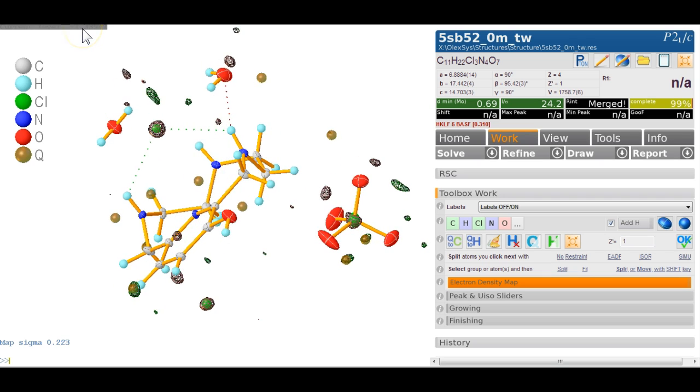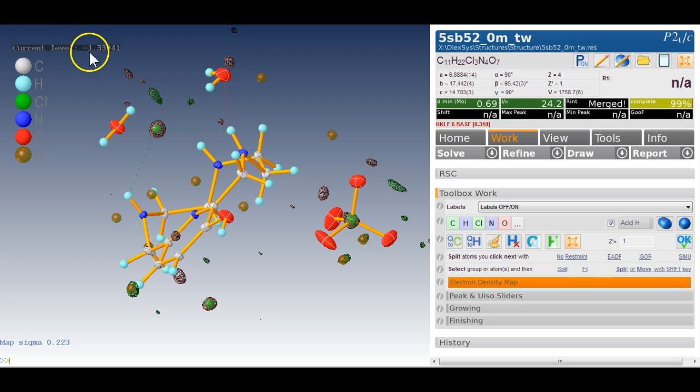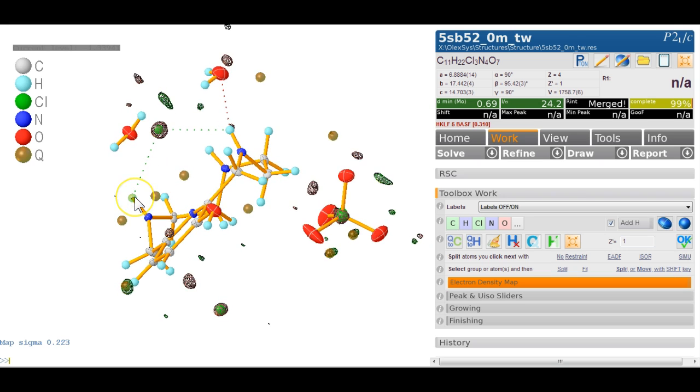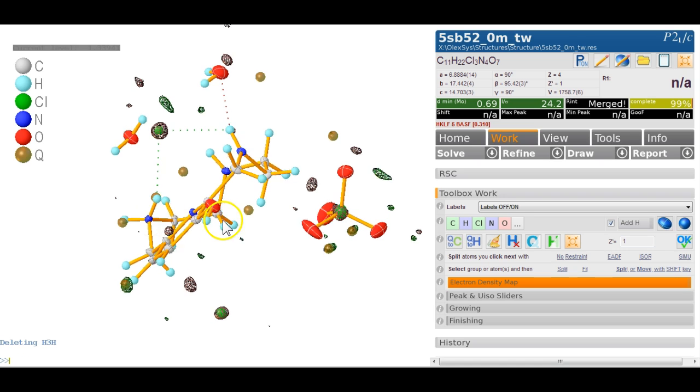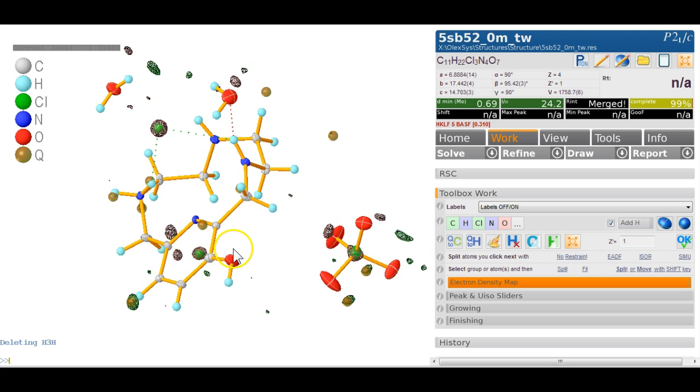It's hardly visible. So we have to fix this. So F4. This is minus 1.33. There's a bit of excess charge on those chlorides, so this might not be right, but first of all, fix this up. We delete this hydrogen here. Clicking on the nitrogen and typing HAD will probably add the hydrogens correctly. Yes, something had gone wrong in that file and the hydrogens were not placed correctly.